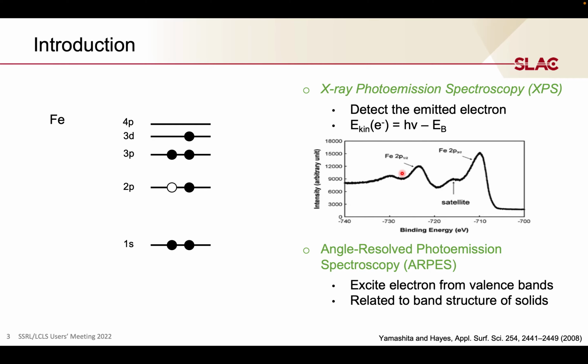That's because the 2p electrons interact with the 3d electrons, meaning that from these curves you get information about the 3d orbitals, including ligand mixing, which gives rise to the satellite, a little bit of geometry, and the number of electrons.